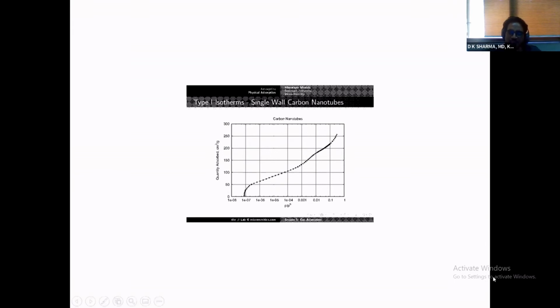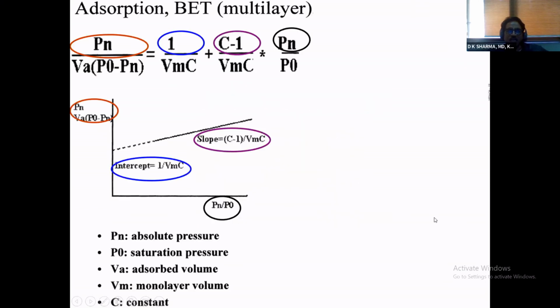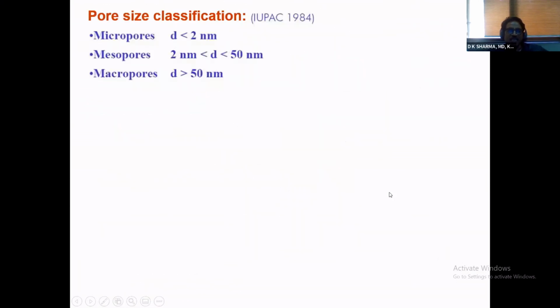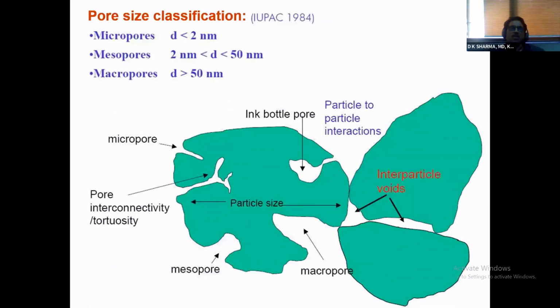So you have to provide extra transducers there. If you are measuring microporous materials, you have to select a proper instrument to do that. By the way, the one that is at NML is capable of doing it, so that is okay.